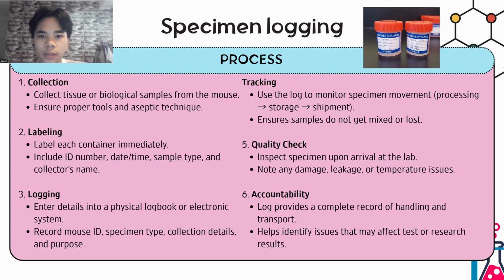Now I'm going to talk about the specimen logging. First, we collect the tissue or the biological samples from the mouse and use proper tools and aseptic technique, so as to prevent further contamination.